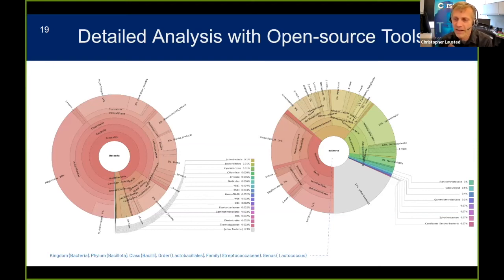So with that, they could speculate that from the time the sample was deposited in the litter box to the time it was collected, it was probably visited by a fly laying eggs. With food samples, like the pickled samples, they could find vegetable DNA, for example, cucumber chloroplast reads. So that's just an example of some of the observations that the students made.